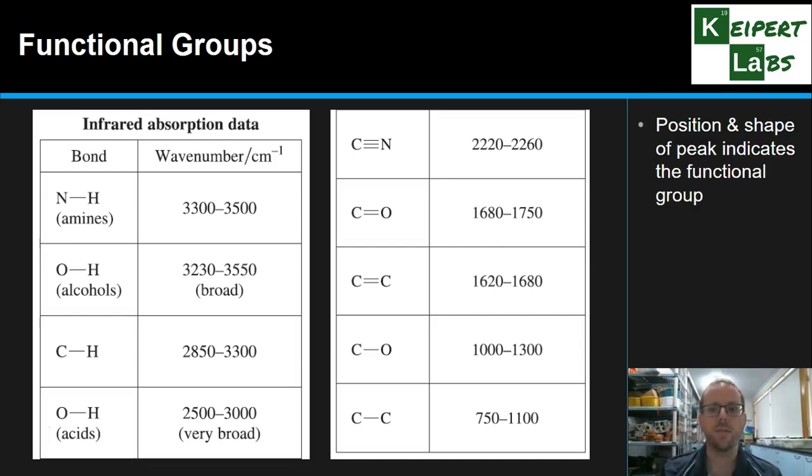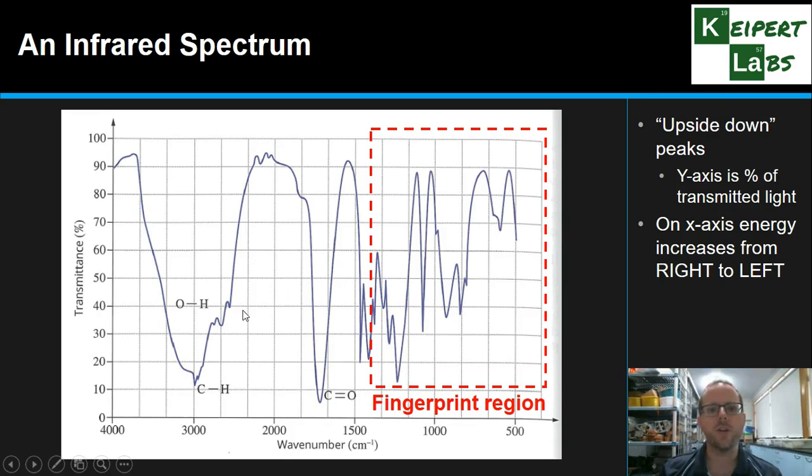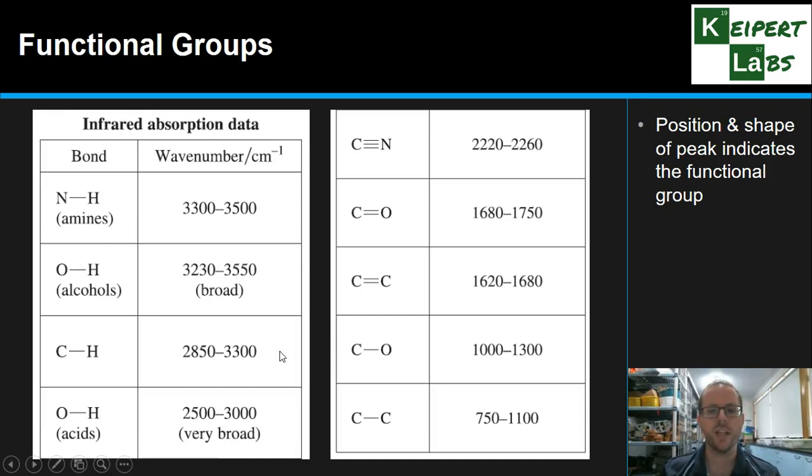Because you can see that these OH groups here corresponds to either an alcohol or as part of a carboxylic acid. But the shape that we see and where we see it will be different. So if I flick back to here, so this is the kind of OH group that we would see from a carboxylic acid. It actually blends over the carbon hydrogen stretch. The nickname is it looks like a hairy beard. It kind of comes down in this wide sort of thing with these scraggly bits at the end. Whereas for an alcohol we would see it being further up and a bit more distinctive. So the shape that it has is also useful information to help us identify what functional group is present.